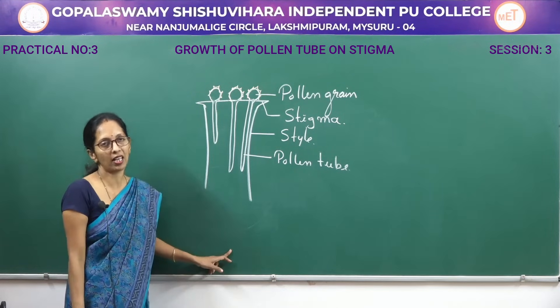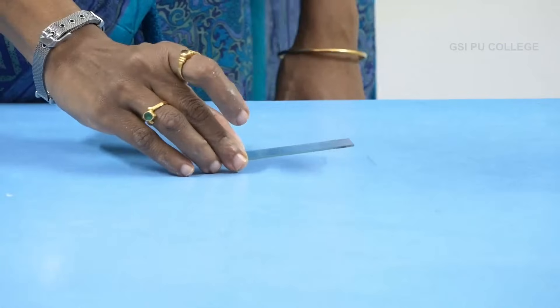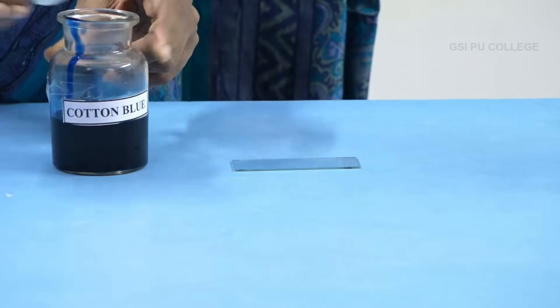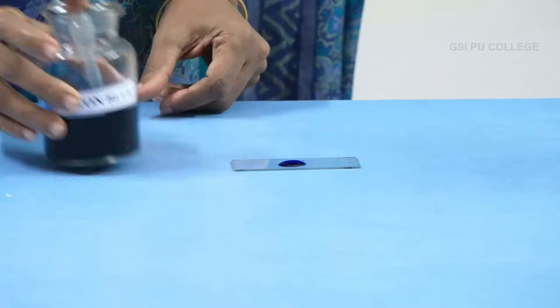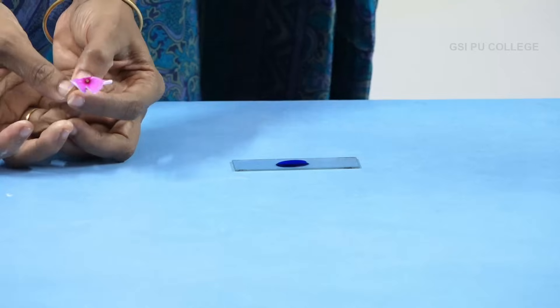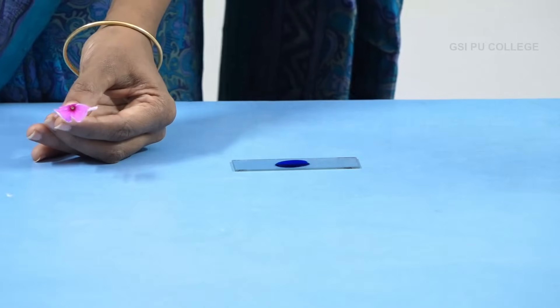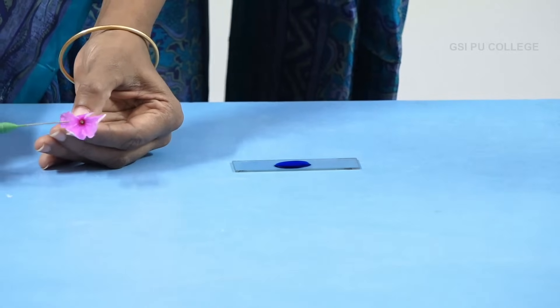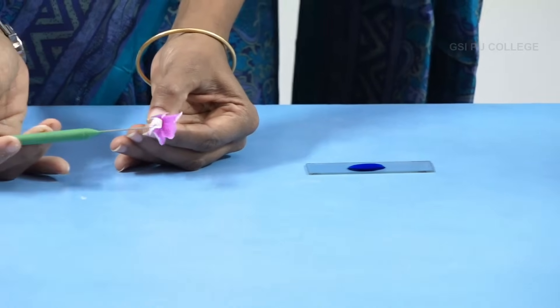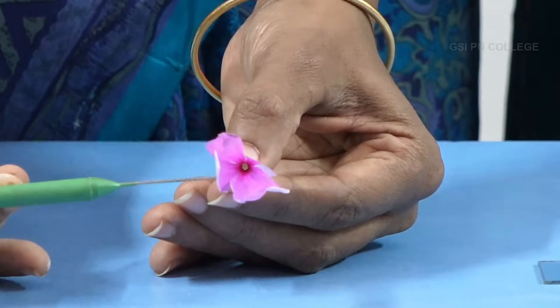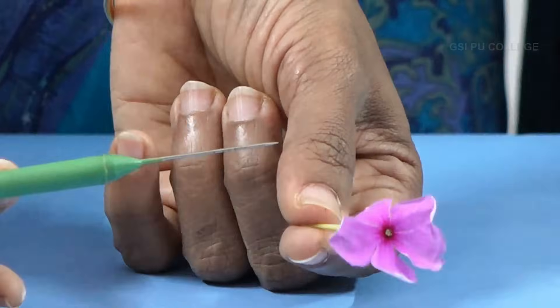For this experiment, take a glass slide. We are using cotton blue stain — add one drop of cotton blue stain. We are using a Vinca rosea flower. This is the corolla tube, these are the petals or corolla lobes, and inside this tube there is a presence of the ovary.